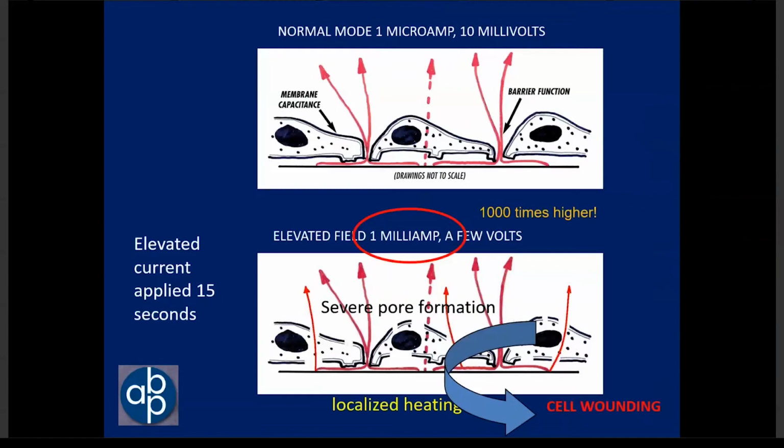If we leave this elevated current on instead of for just a fraction of a second to electroporate the cells, but rather for several seconds, we get severe pore formation, possibly a bit of localized heating beneath the cell, but whatever the cause, we kill the cells on the small electrode.